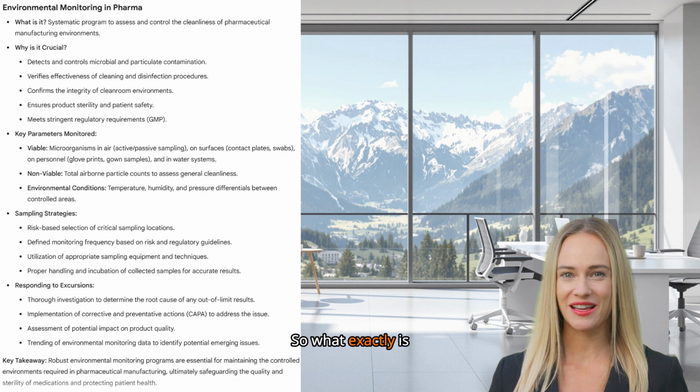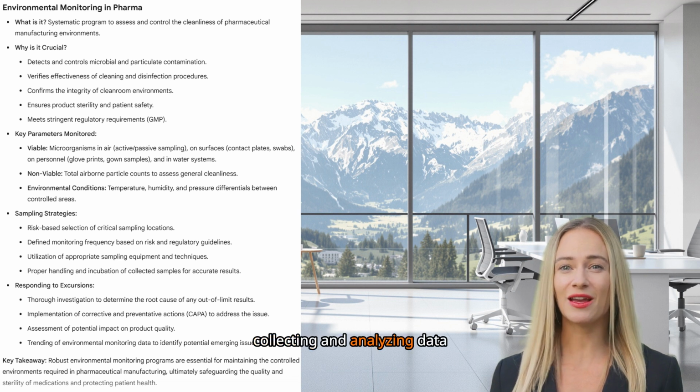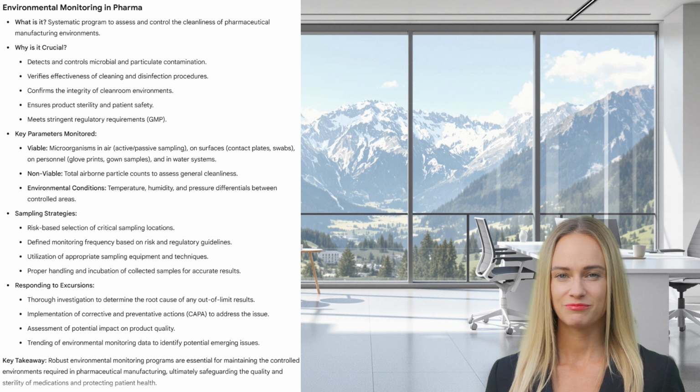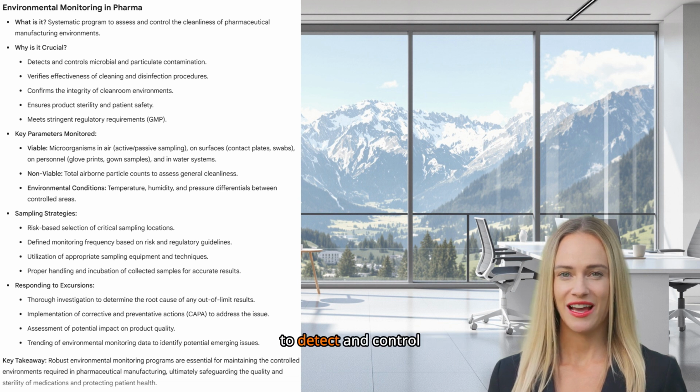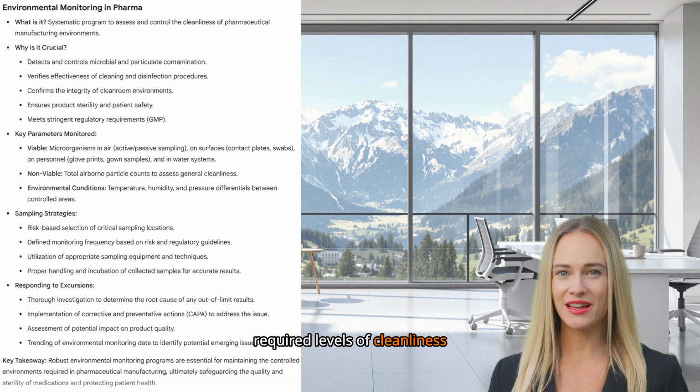So, what exactly is environmental monitoring? In simple terms, it's a planned program of collecting and analyzing data about the environment within a pharmaceutical manufacturing facility. The primary goal is to detect and control contamination, both microbial and particulate, ensuring that the manufacturing areas maintain the required levels of cleanliness.